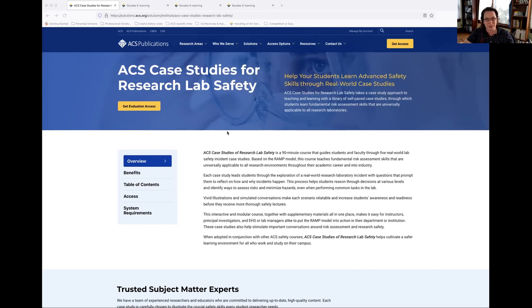However, once they enter the research lab, as either graduate students or advanced undergraduate students, they find themselves in a much more independent role where they are expected to more deeply understand their science and plan the safe execution of their own experiments. Not only do they need to become more familiar with the resources available, they also need to become more assertive in reaching out to those who can help them plan better, whether that is their PI, other student researchers in the lab, or safety professionals at their institutions.